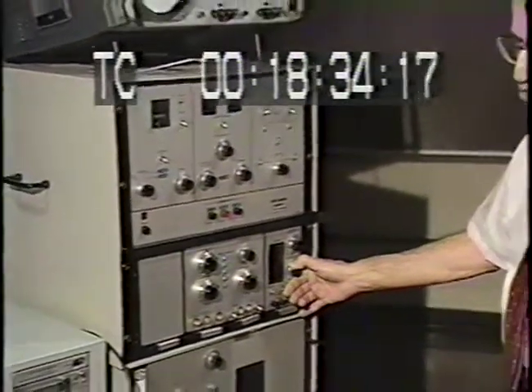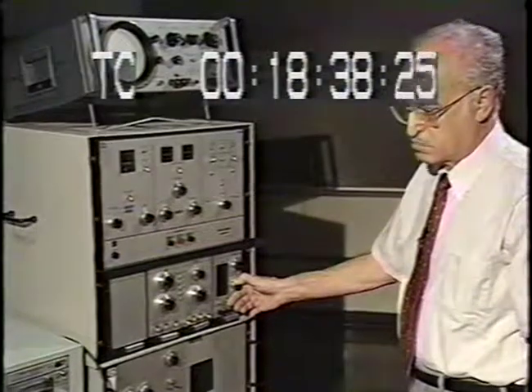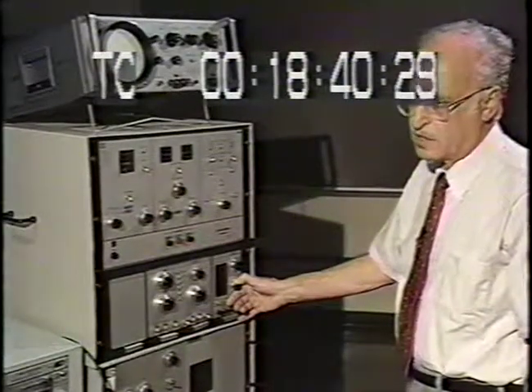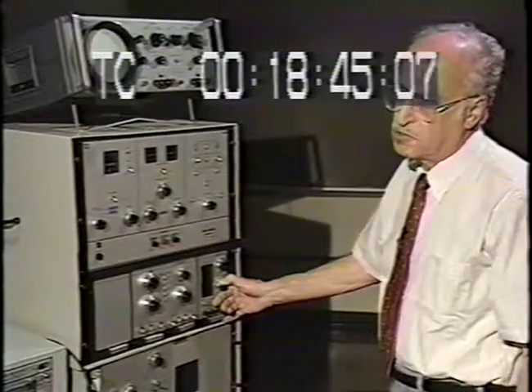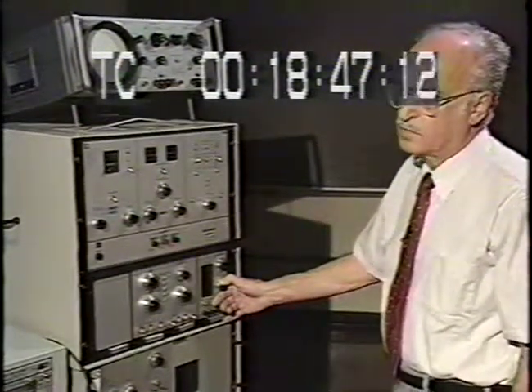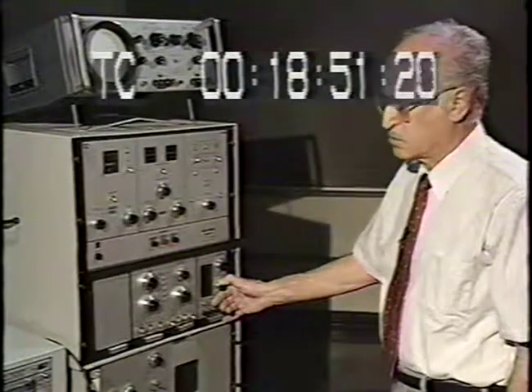I am surprised that not many people have used a sorter for this type of work. It has been used more for fluorescent antibody work and not for quantitative cell counting.